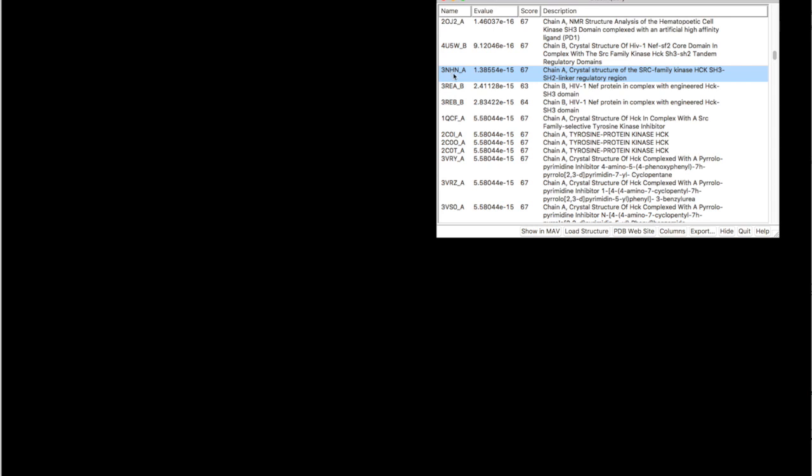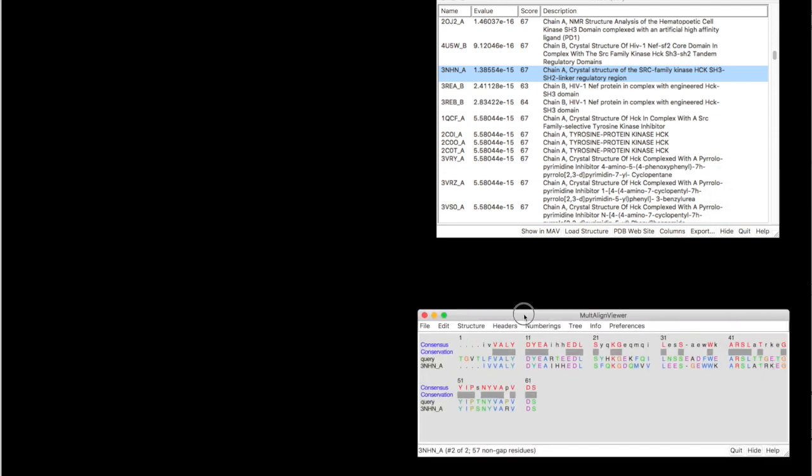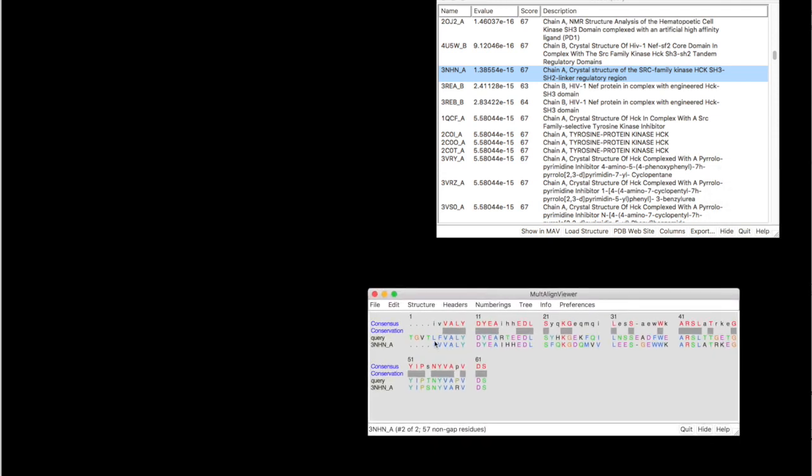Once you select your template, you are going to click Show in multi-alignment window. And this is our model.